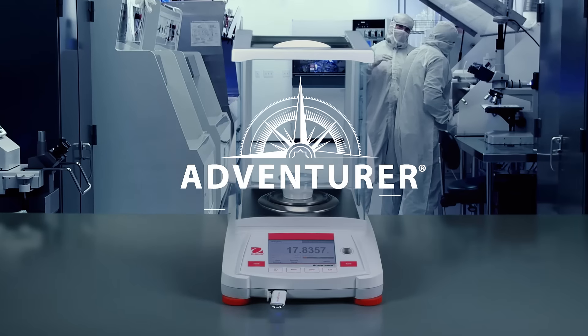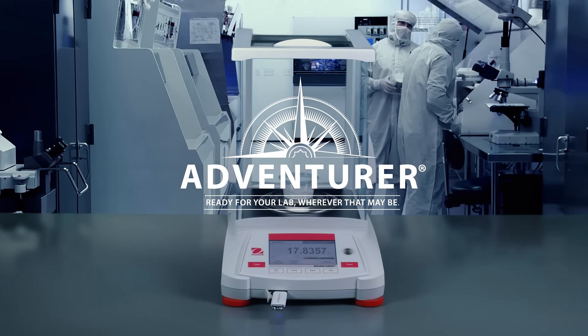The all-new Adventurer, ready for your lab, wherever that may be.